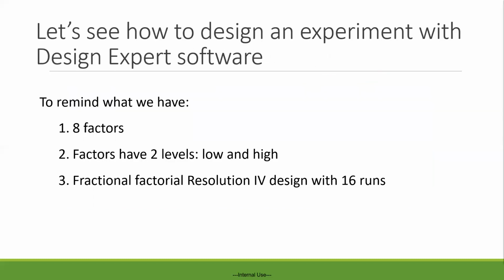Next, let's see how to design the experiment with the Design Expert software. To remind, we have 8 factors, and each factor has two levels, low and high. And we use the fractional factorial resolution 4 design with 16 runs, which is 16 treatments for this experiment.